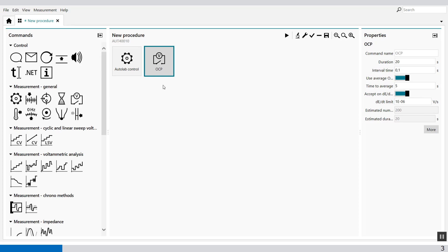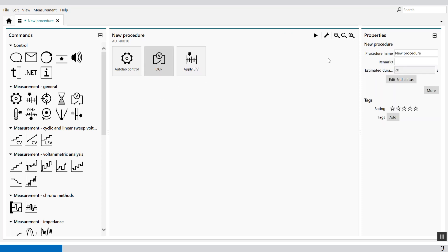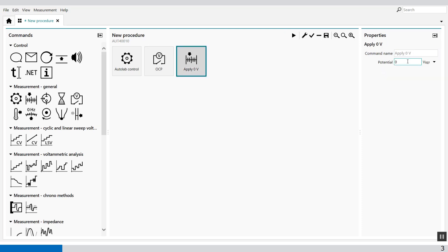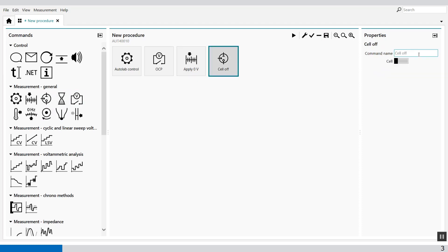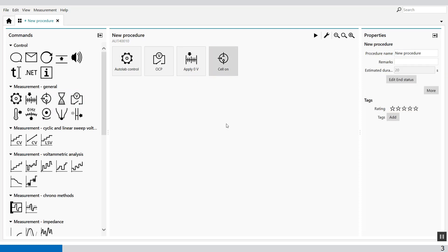Then we set the potential to 0V with respect to OCP. We select the set potential value and apply it — 0V with respect to OCP, like this. Then we switch the cell on and wait for 3 seconds.